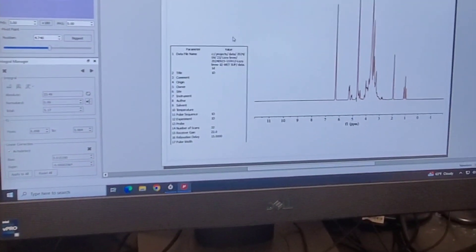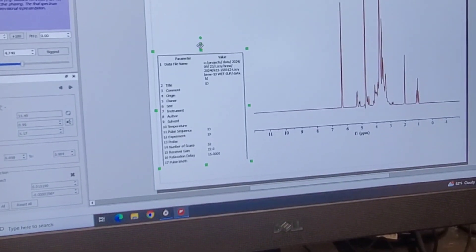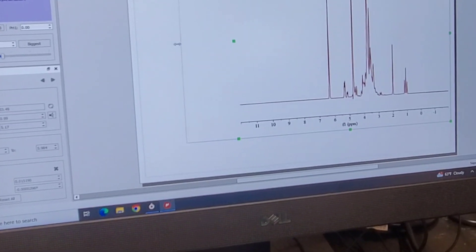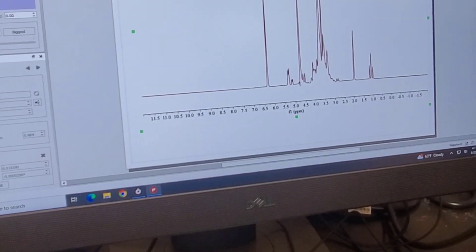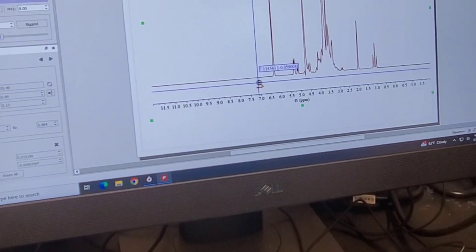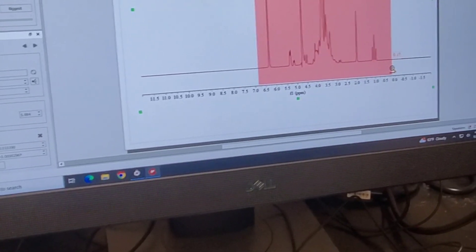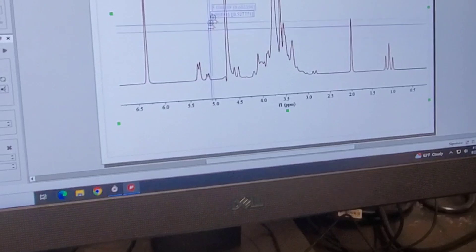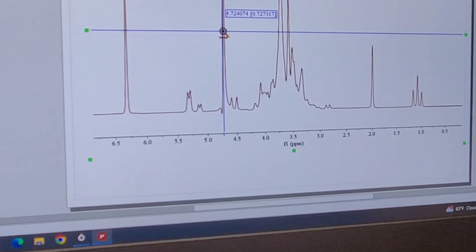First I'm going to delete the side panel we don't need and expand the spectrum outward. Then I'm going to expand the view from about 7 parts per million out to about 0 parts per million — basically everything we're going to need. This region here is the water suppression zone, where the original water peak would normally be absolutely massive, but we've made it quite small so we can see the other peaks around it.